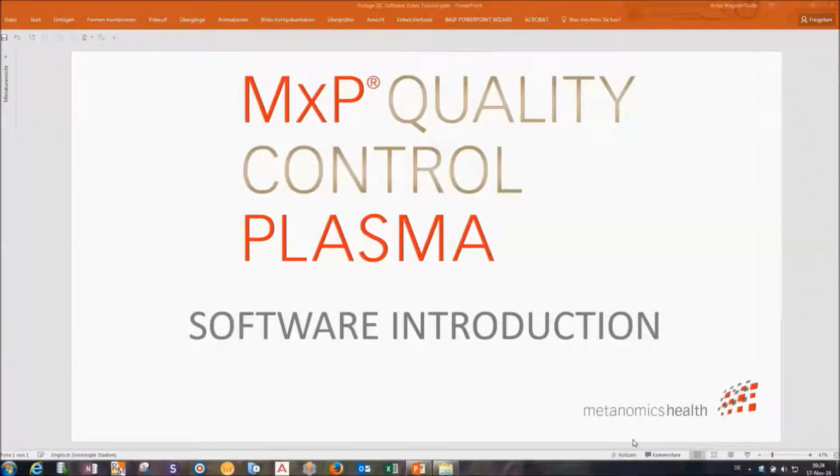This video provides an introduction on how to analyze the quality of plasma samples with the help of the MXP Quality Control Plasma software that is provided by Metanomics Health.